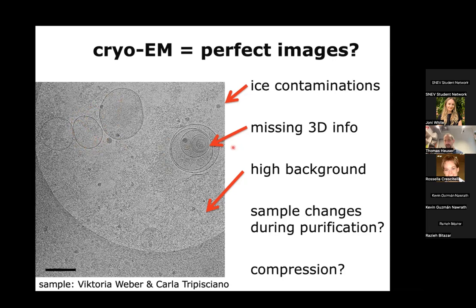And then, as I said, EVs are not always these singular round-shaped objects as we often think of them. Here's a good example where you have an EV in an EV in an EV, like 3 or 4 layers of complexity.